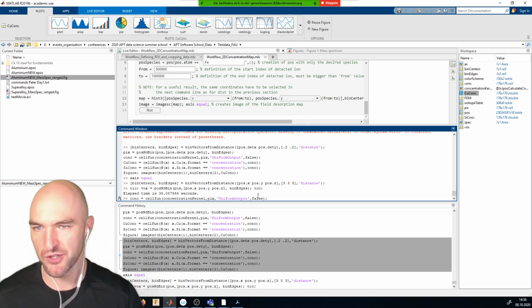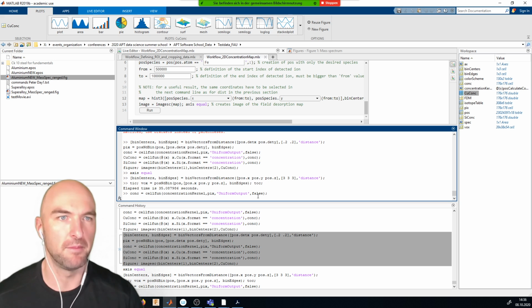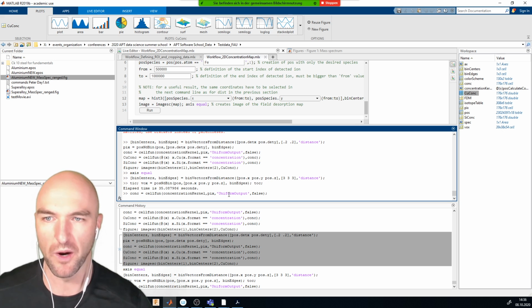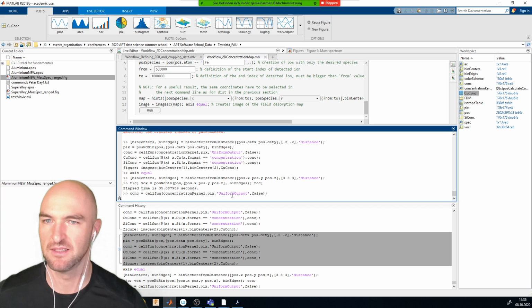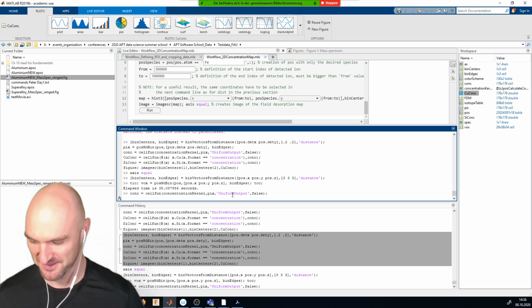the concentration works exactly the same as before, but now you can see our voxel grid is 39 by 38 by 54 cells, so it's quite a number of cells.